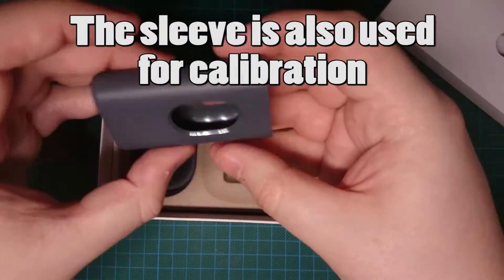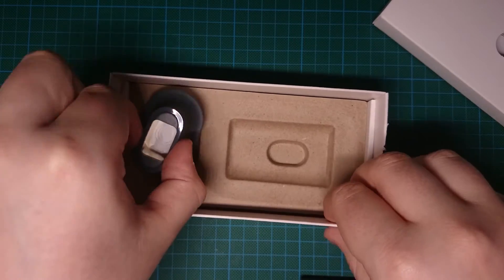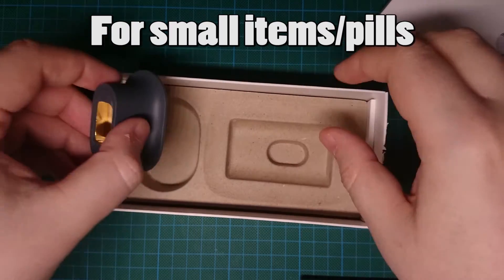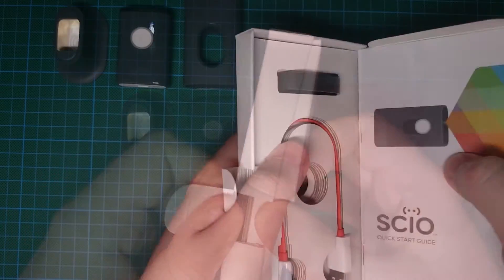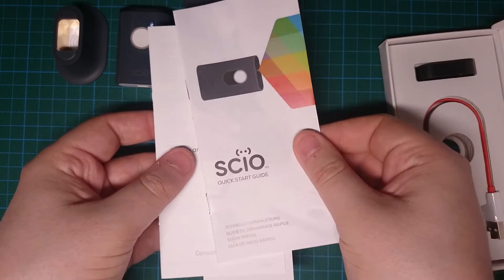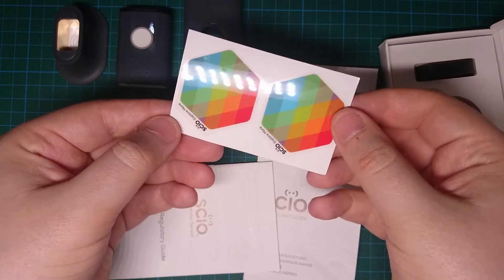It comes with a nice little sleeve, a pill tray. And let's see what's in here. Literature wise, we have a quick start guide, regulations, and some stickers.